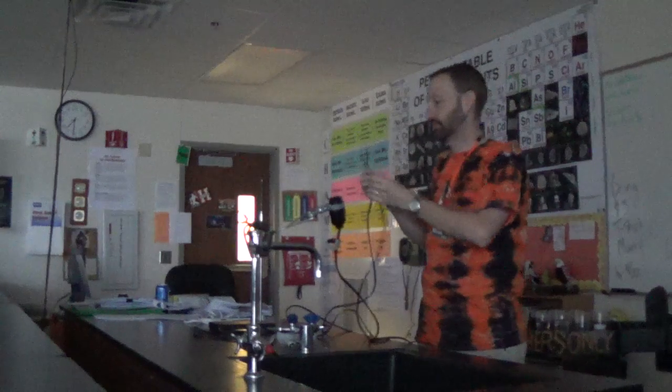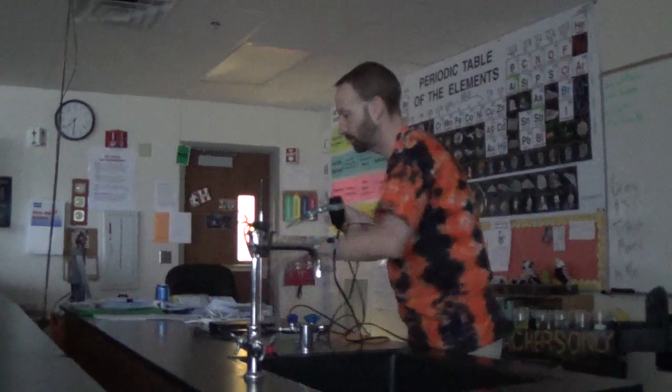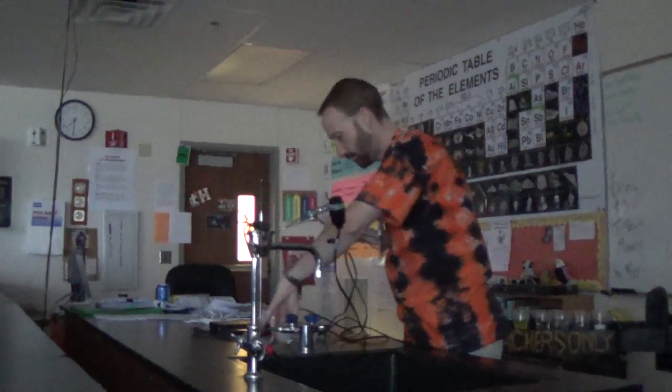So let me explain the setup I've got up here. I have done that which you should never do. I have taken a lamp cord and I've cut the wire, and I've exposed the ends of the wire. And I have light bulbs.